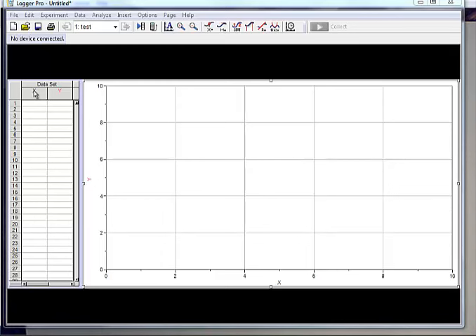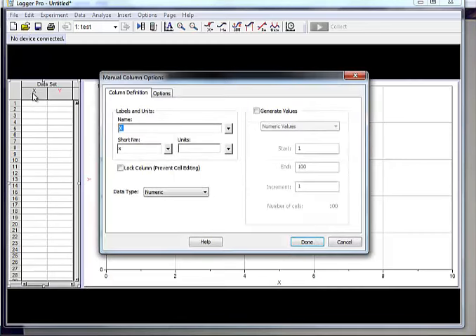When you're graphing, where does the independent variable, or manipulated variable, go? It always goes on X. If you look at this data set here, there's an X here. Double click that, and let's set up that variable to look the way we want it to look. First of all, we need to figure out what we're going to call this. If that's the independent variable, what are you changing in the lab? The amount of salt.